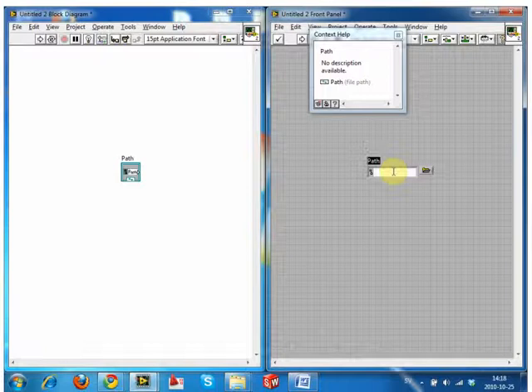So right click on the front panel, not the block diagram. Right click on the other side. Here. Okay. You want to create new or? Yeah. So you want a new VI? Blank VI. Yes. And then you want what? Oh yeah. Okay. Text control. Yep. All on the right. Path. Yeah. Yep. So you can do it with a string.